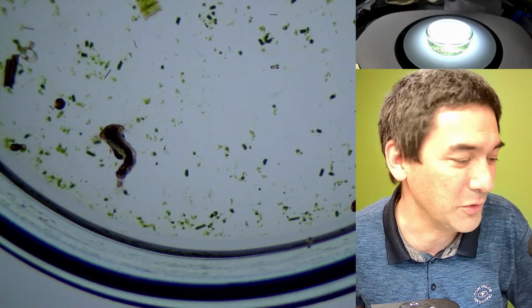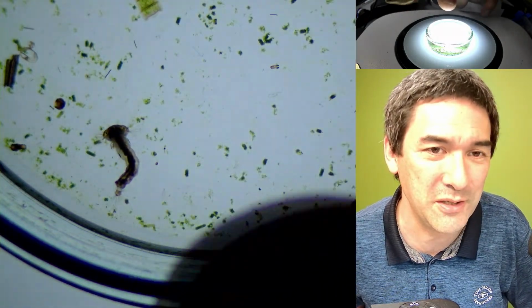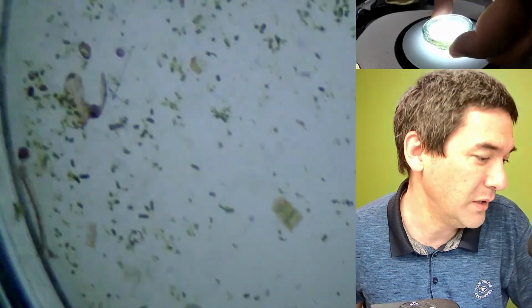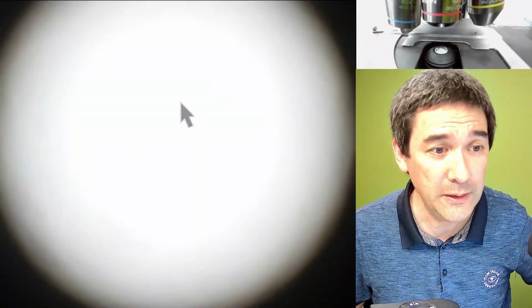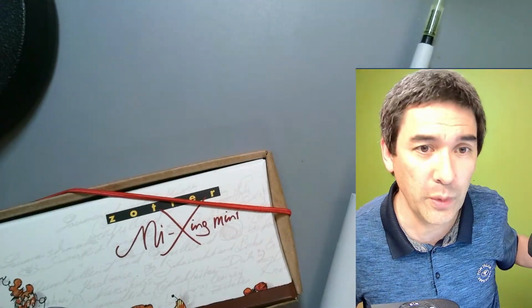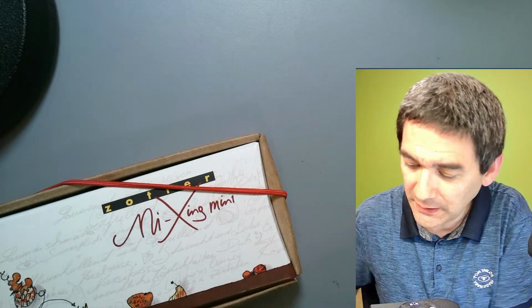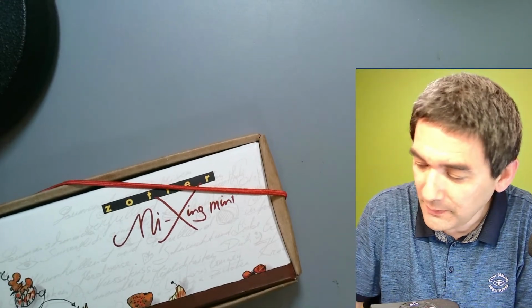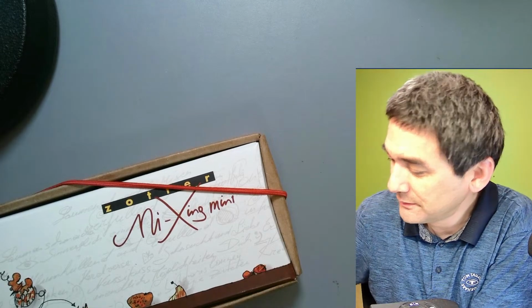Maybe look at all the green spots on the bottom that you see here. Yeah, maybe also some kind of algae. I don't know. In any case, I'm going to put this away. And I need the, how do you call this, the stereo microscope, and we're going to unpack this here. And don't worry, a full video will follow, because I'll be eating this stuff, not today.